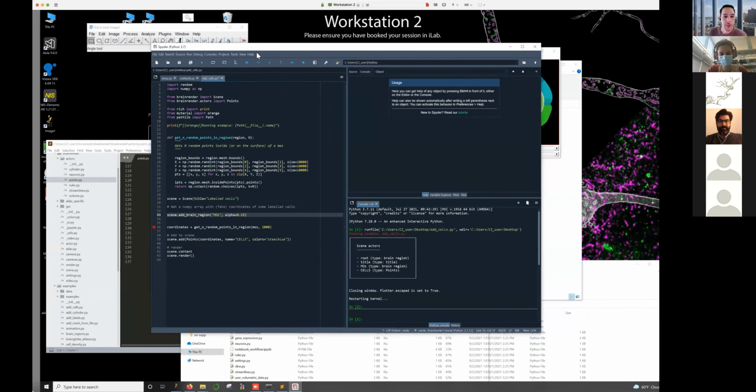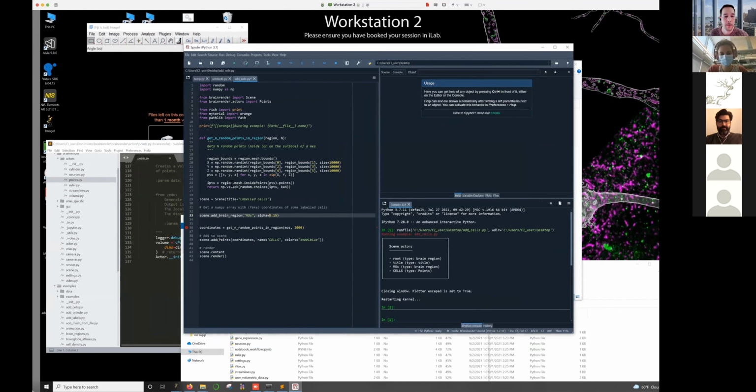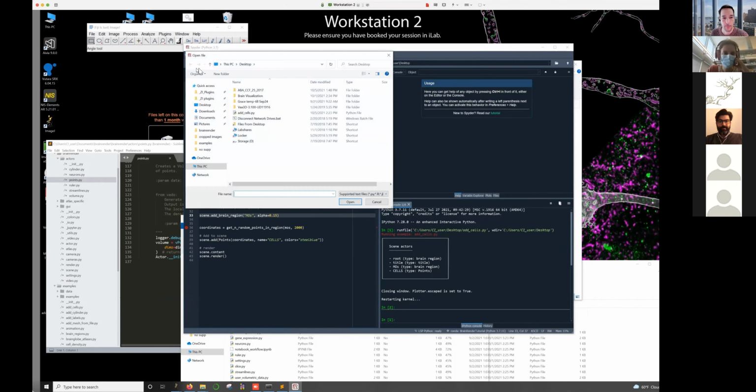Cool. So the first thing, we've got this working. Hopefully everyone has got it working. Just having it render in full screen, I find is a little bit annoying. So straight away, if you're trying to troubleshoot this or get it to render what you're interested in, you want to change that. And the best way to start changing this is to have a look in the settings file. So we can just open up that file.